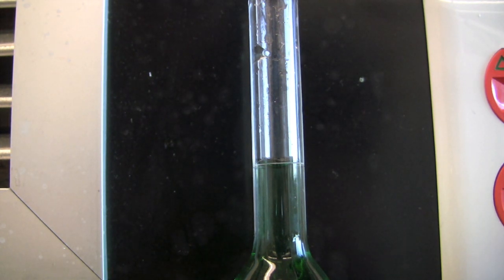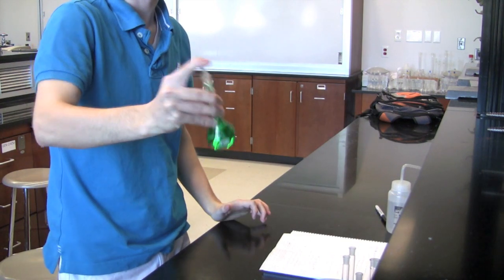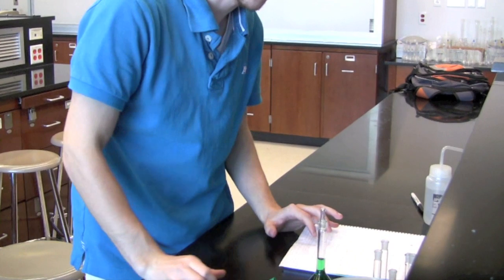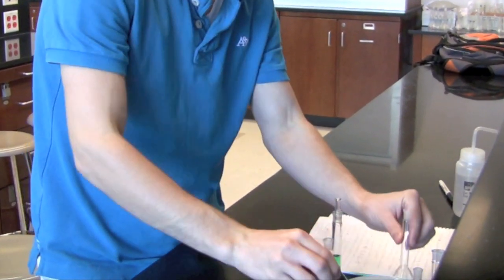Continue to shake your solution to make sure that it's all dissolved in the water. We will now make different concentrations by diluting the 50 milliliter stock solution into separate 25 milliliter volumetric flasks.